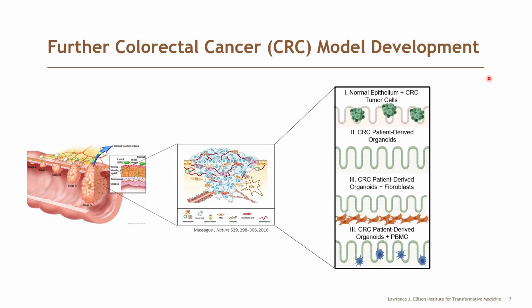And before I go into the cool biology, I just want to have a brief word that we are working on other model systems. Back in my day as a grad student, I was using this model with colon cancer cell lines. We've now expanded into the patient-derived organoids. We do have the patient-matched cancer-associated fibroblasts that we are also layering on to better understand the stromal tumor crosstalk. And in addition, we just started with these immune cells, adding in the PBMC components to this model system to really start to understand all the different crosstalk with the different cellular milieu.